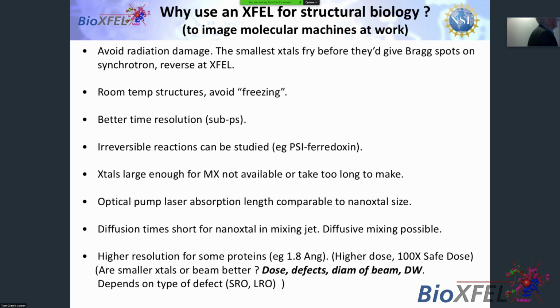Crystals large enough. The problems that Ed talked about, cases where we only have little nanocrystals. I mentioned the optical pump laser absorption length is comparable with the crystal size, so we can do diffusive mixing. If you think about putting cream in your coffee, right? You would sit there forever to wait for the cream to mix throughout the coffee. That's diffusive mixing. Or a drop of ink in a beaker of water. It just goes in and sits there, doesn't it? That's Einstein 1905, diffusion. If you stir it, everyone stirs their coffee because you're impatient, you don't want to wait. That's the time difference between diffusive mixing and turbulent mixing. And because our nanocrystals are so small, we get away with diffusive mixing.